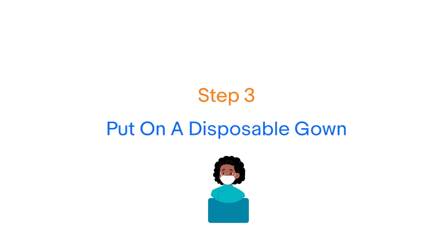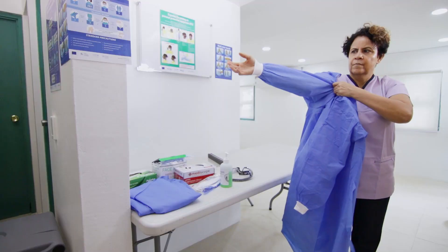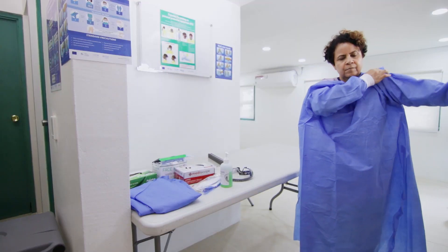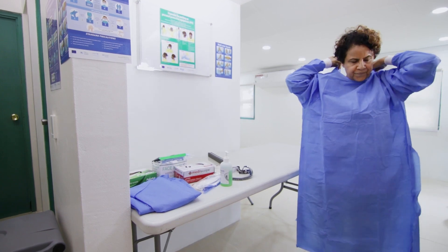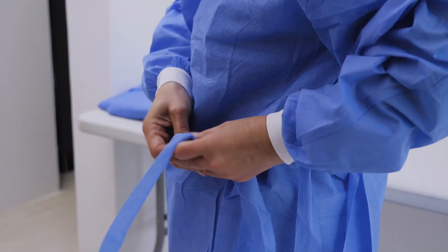Step 3: Put on your gown. Check that the equipment is intact and not damaged. Ensure your gown does not touch any surfaces such as the floors or walls. Tie the gown around the back of the neck and waist.